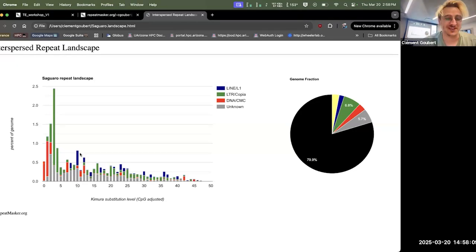Yeah, but anyway, you should have this, right? And so this, as I was telling you, if I were to do a very simple interpretation, I could see that we have overall a recent amplification, or at least relatively recent, of TE.